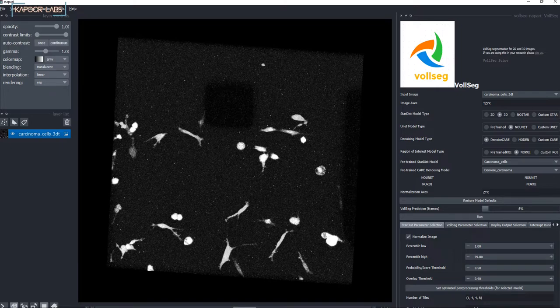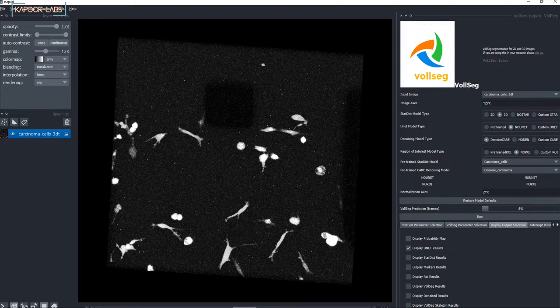And since the process is running in the background, you can reselect your display options and say that, well, I just want to see all of them. So you restore the display defaults, and then you wait for the computation to be over. The progress bar will actually show you at which time point it is at that moment, and then you just wait for it to go to 100% till you see all these results again appearing on the left hand side.